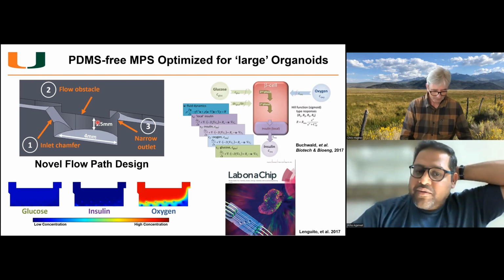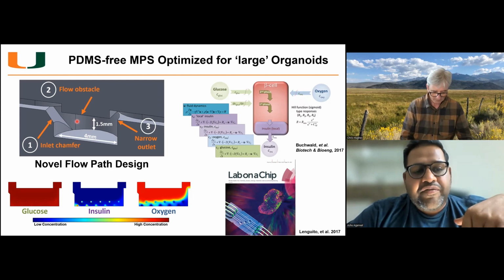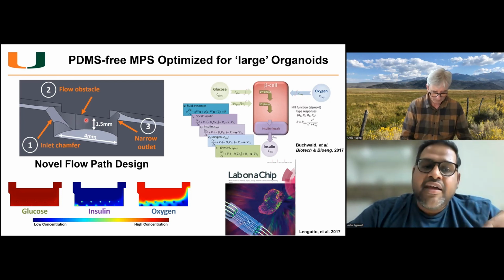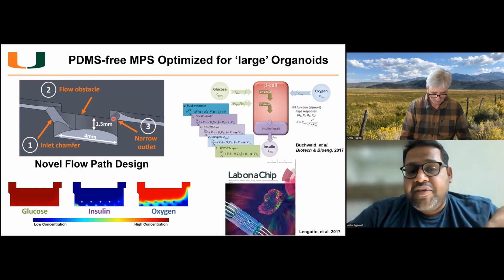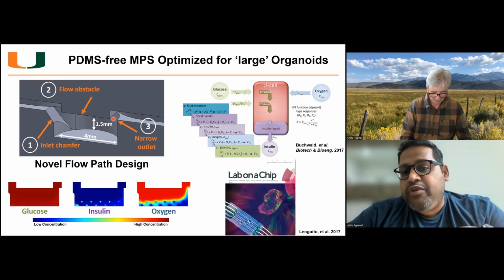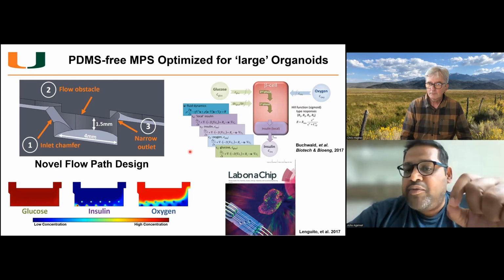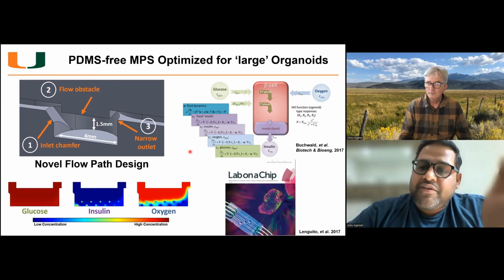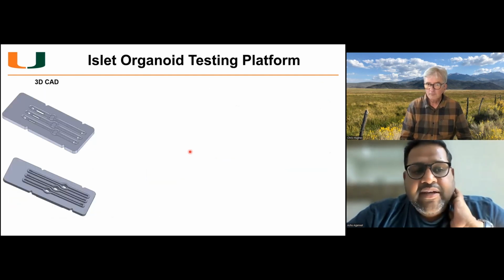So the family of devices in the lab are all created using these geometric features, both on the inflow side at the cell culture area, but also at the outflow side, so as to create a pseudo-laminar flow. And we couple these geometric features, just like Dan and Chris, with computer simulations of not just the fluid dynamics within the platform, but the fluid dynamics are coupled to both insulin release based on local glucose concentration and local oxygen concentration, which is also what, as I just said, Chris and Dan do.